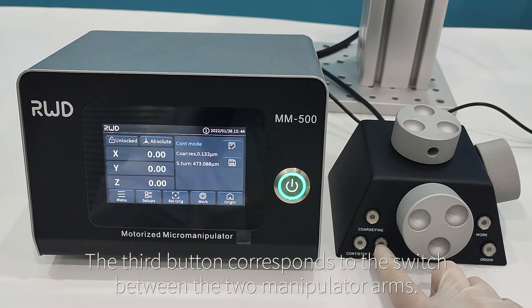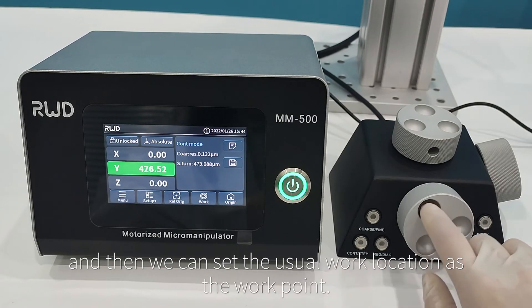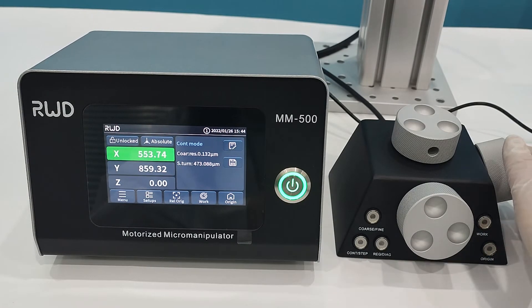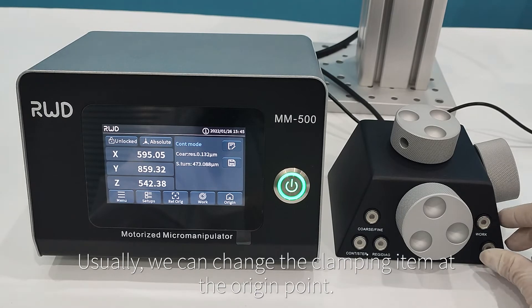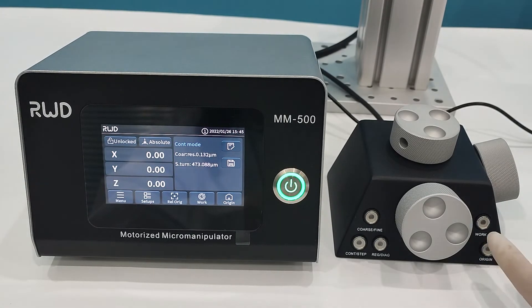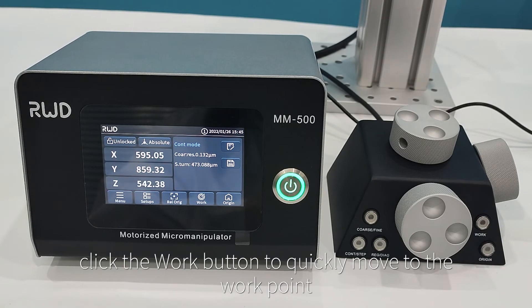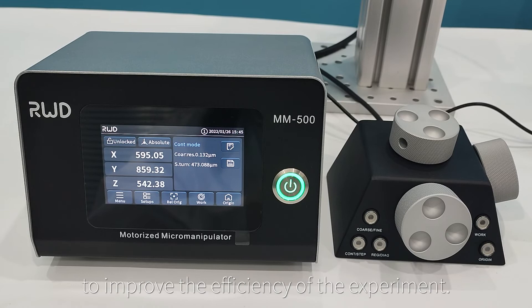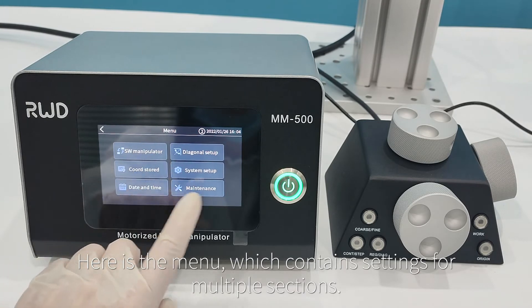The third button switches between two manipulator arms; button light off means arm one mode. We can set a certain location as the origin point and set the usual work location as the work point. Typically, we change the clamping item at the origin point. After replacing items, click the work button to quickly move to the work point, improving experiment efficiency. The menu contains settings for multiple sections.